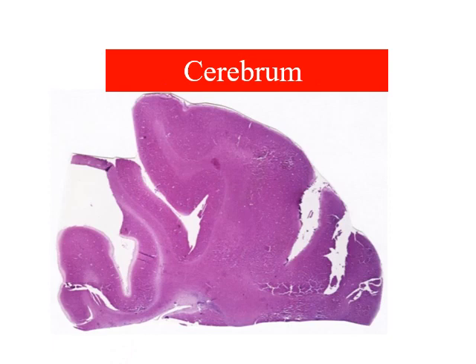This is a section in the cerebrum which is formed of sulci and gyri. There is outer cortex which appears dark gray matter. The inner medulla appears pale, and the outer cortex, which is the gray matter, appears dark.